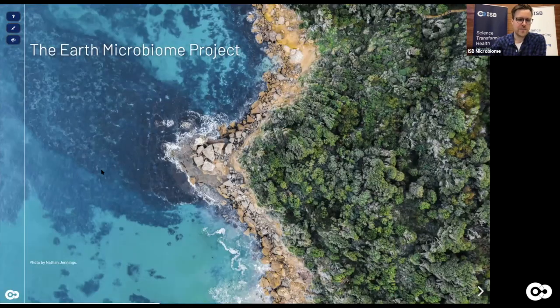So, okay, that's a lot of background right now, maybe you're getting itchy to actually start analyzing something and get real data. So what we'll be looking at today is data from the Earth Microbiome Project. And I should note that today and also tomorrow, the data that we analyze is not something where the analysis is already done in a paper. It's something that we will do only in the course. So whatever you discover is kind of new. So that will be exciting.